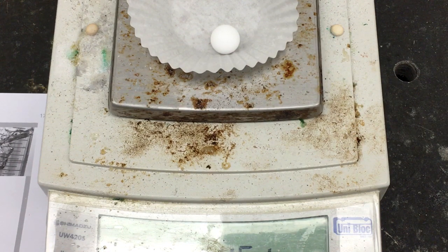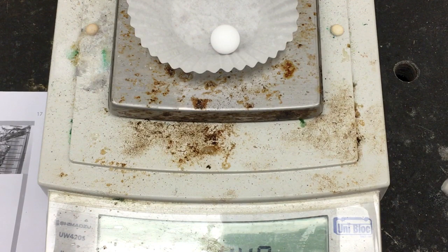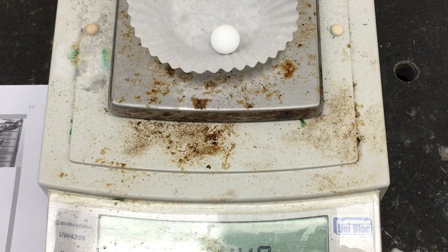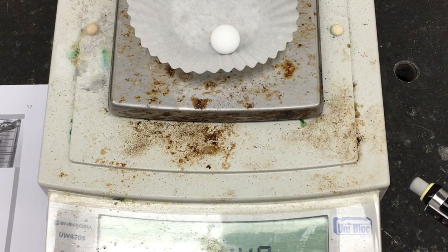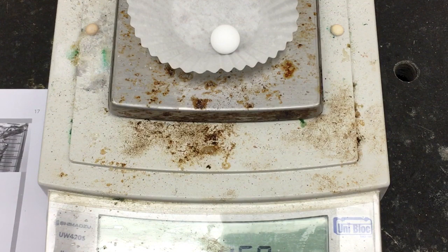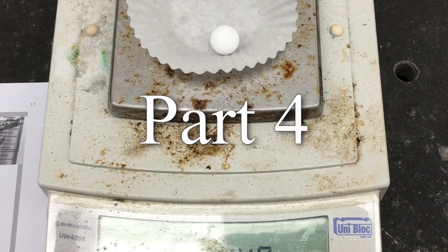In an ideal world, however, when we manufacture things, we find that that is not the case. Every big screen TV that you could buy in Costco is maybe going to have a slightly different dimension of the plastic casing for the outer frame. That's just the way the world is. Okay, so we have our mass. We'll go ahead and go over to our lab bench.